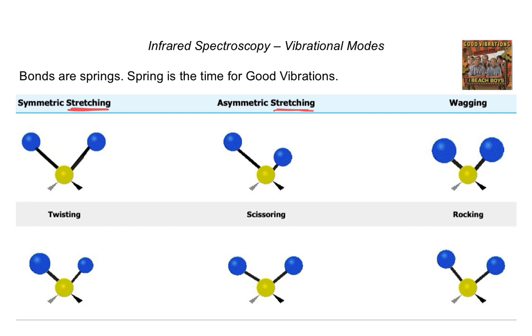And in addition to the region on the x-axis where these things occur, that's why you see a lot of jaggedness to these peaks. Because from the uniqueness of CH groups, you have all these different hydrogen sets. Some of them are doing this, some of them are doing this. They all overlap in one region, and the peaks look really jagged.